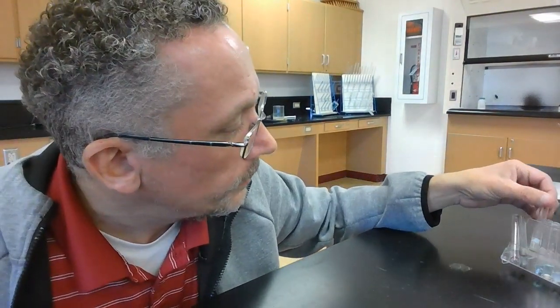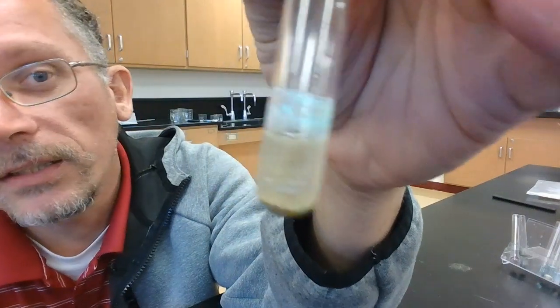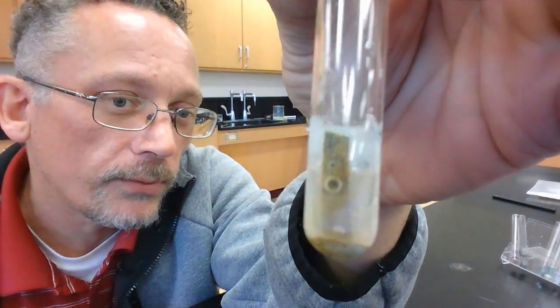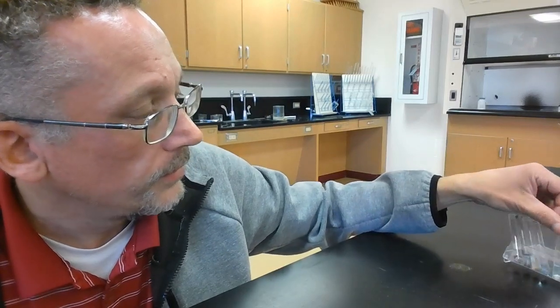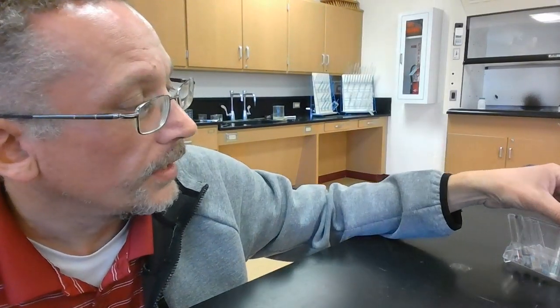Let's see, the magnesium is reacting quite a bit. You can see it looks kind of dirty in there. There's some powdery stuff on the bottom, and a lot of the blue has gone out of the liquid. So definitely a reaction with the magnesium. Let's see, the silicon still has done absolutely nothing. This one was the sulfur, it has still done absolutely nothing.